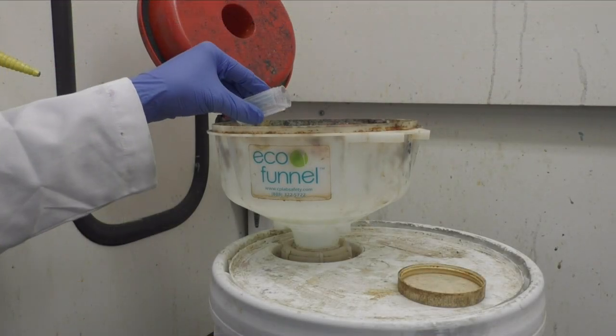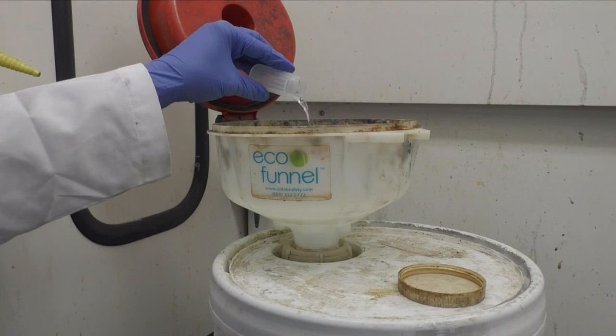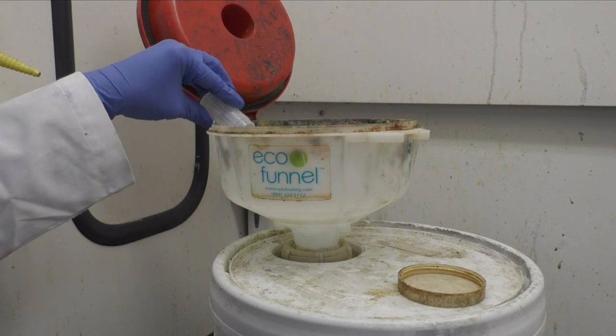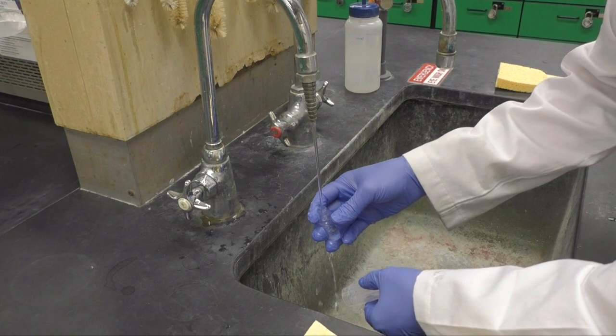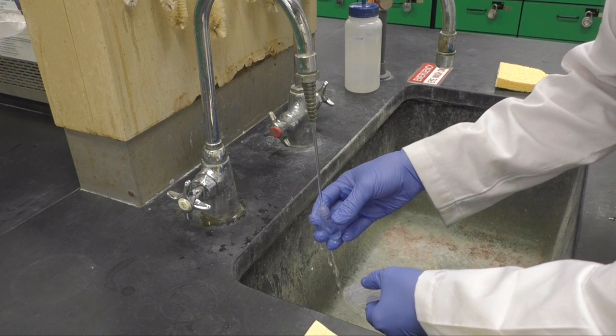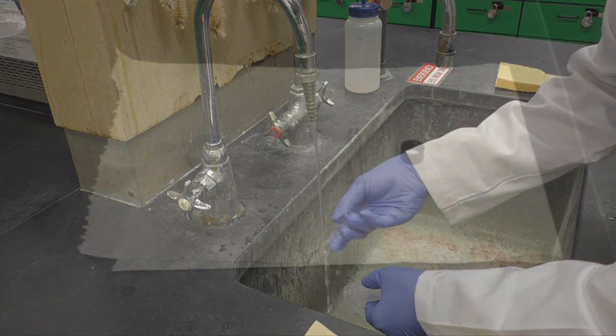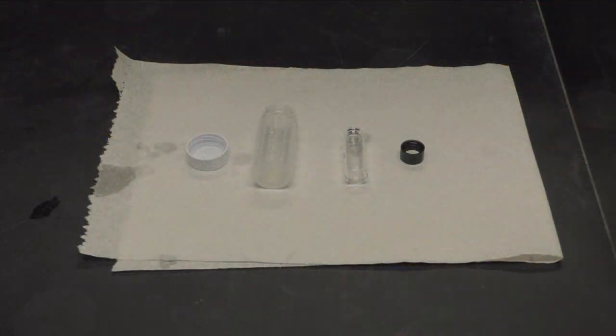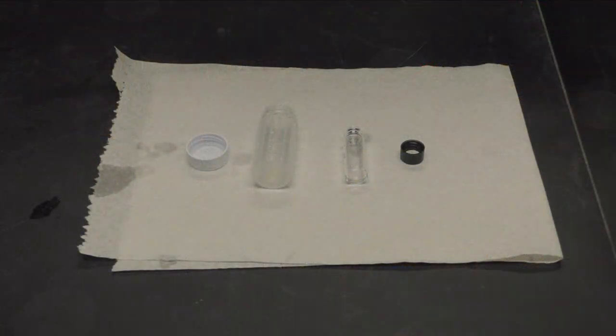When you are done, make sure to dispose of any solutions into the liquid waste bucket, clean any plastic or glassware with deionized water, and leave them to dry in your locker on a paper towel.